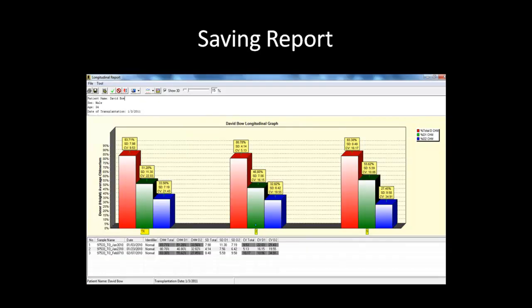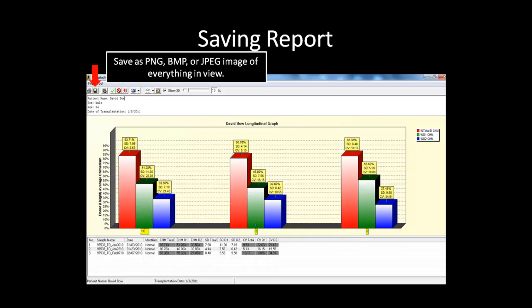After you are satisfied with the display and information of the graph, you can save or print both single and double donor reports. The save icon is located here and will bring up a save dialog box when clicked. It will save a PNG, bitmap, or JPEG image of the current view of the graph, and this is the same for both single and double donor reports. Before closing ChimerMarker, make sure you save the entire project to ensure that analysis and display settings for the individual patient are saved.